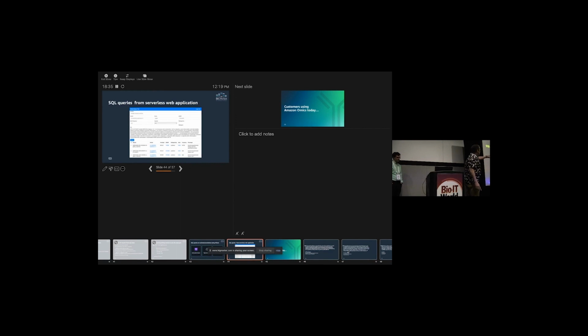It pulls out what researchers want to enter, and the JavaScript comes up with the SQL that gets passed to Athena, which returns the results in the web UI, giving you the variants resulting from your query, which can then give you links out to the UCSC browser, NCBI, or dbSNP or something. So I put this up because that's the value of being able to do SQL queries, joining your variants and annotations. That's the clever trick to provide.